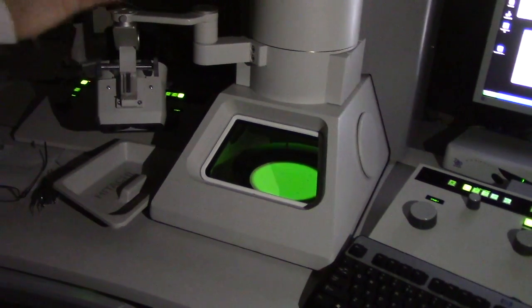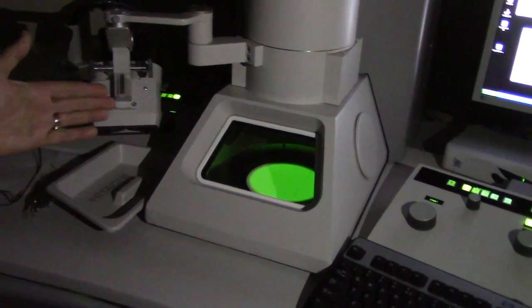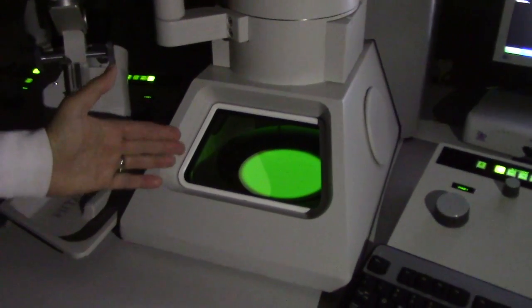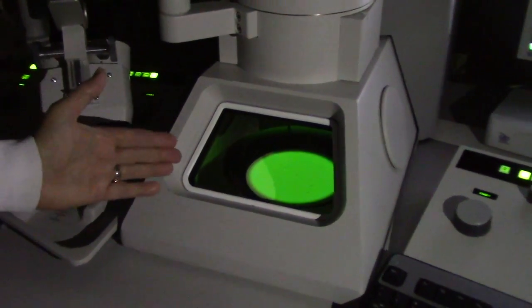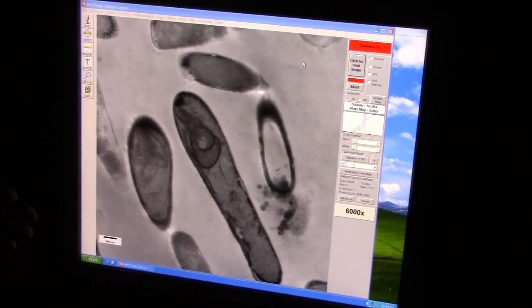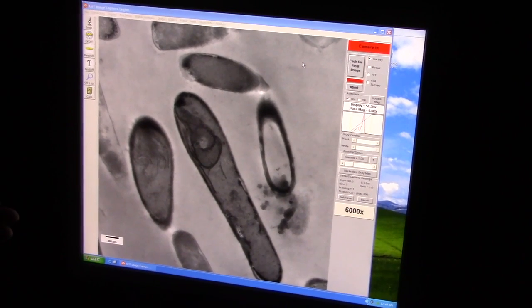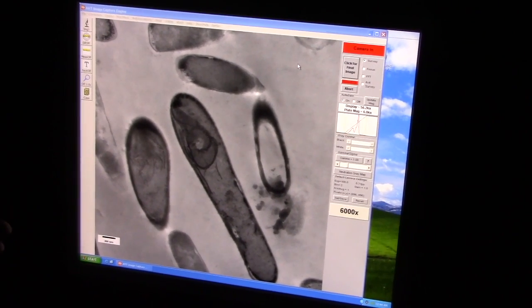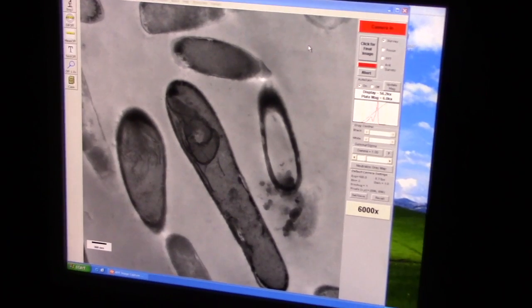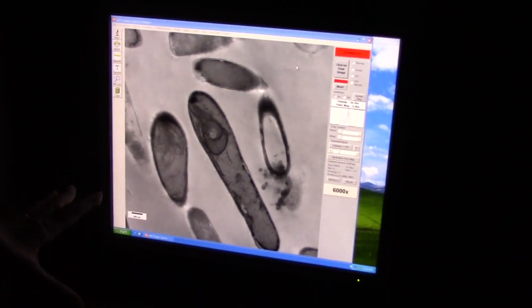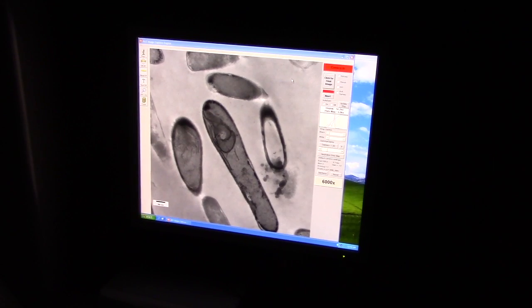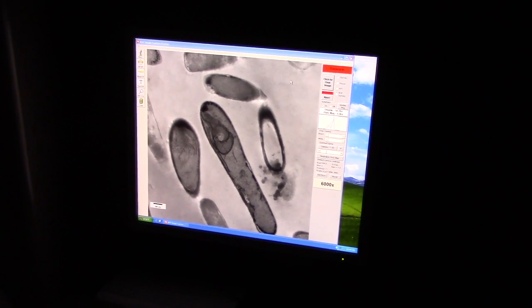I've turned on the scope and started the electrons flowing. You can see the result down here — here's the beam, and here is the image of those spores. Those spores that came to us in that little vial and went through all our processes — we can now image and actually see them on the screen and save those images.